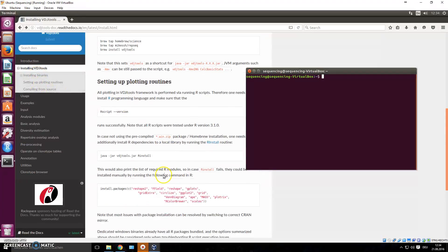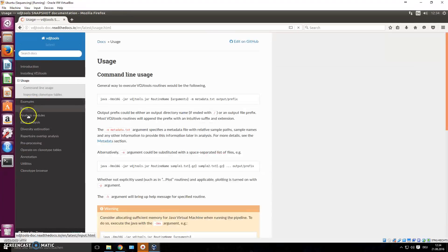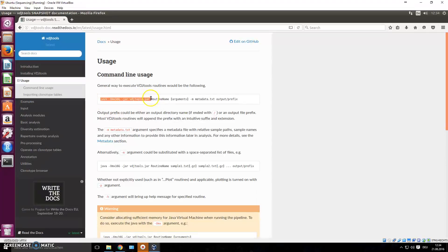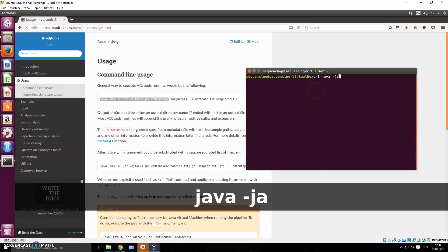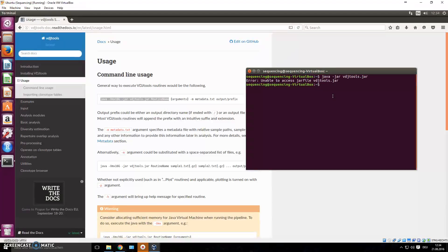We installed it, set up plotting routines, downloaded all the dependencies. Now we click 'Usage' and it shows you how to execute VDJ tools. The general way to execute VDJ tools is: you type 'java', add the memory flag, then '-jar vdj_tools.jar', followed by the routine name. You get a list of routine names by just opening up the jar.